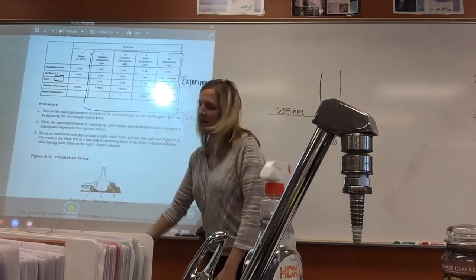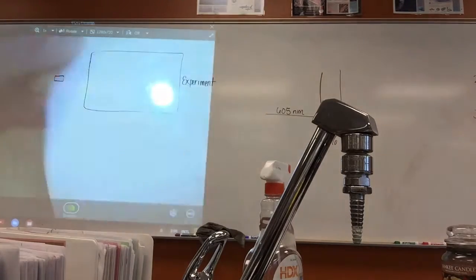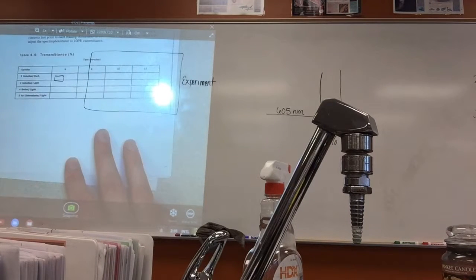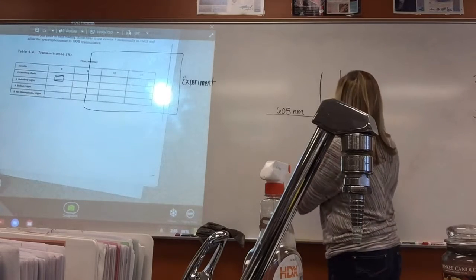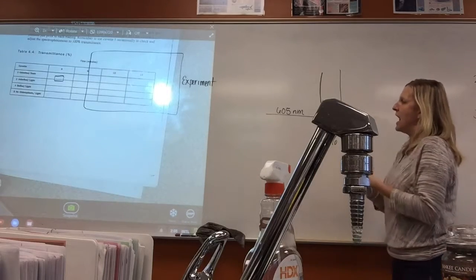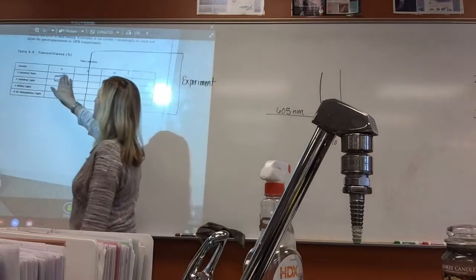And so what they did, as you saw in the table over here, table 4.4, is they did this experiment for 15 minutes. At time 0, they took each one of the cuvettes, each with the DPIP plus the chloroplast solution, and put it in the spectrophotometer and got the percentage of light transmitted.